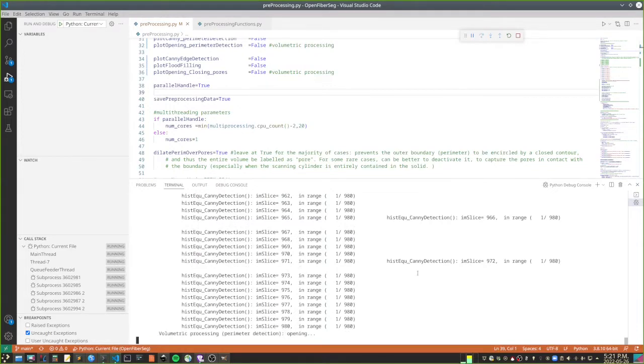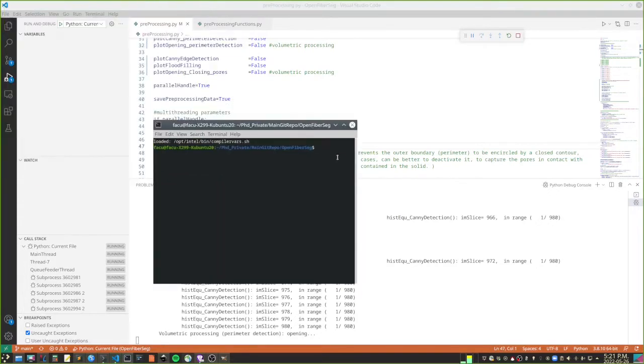I don't know how Spyder will behave, but you can also run the code directly from the terminal. Either Visual Studio Code or Spyder might not like very large data types, and sometimes they do weird stuff with the parallel processing too.